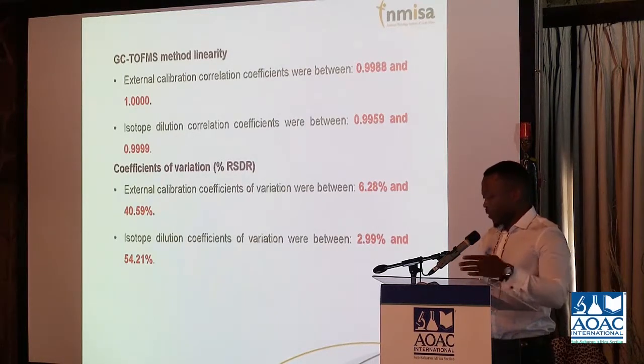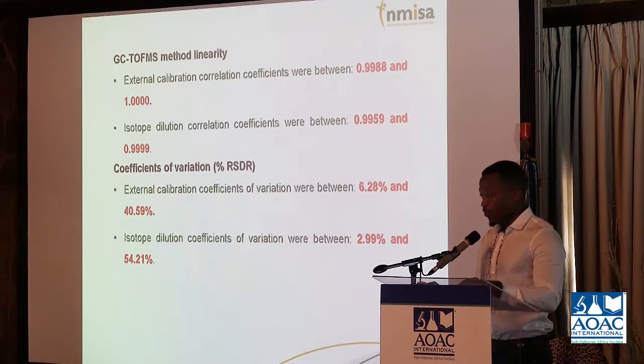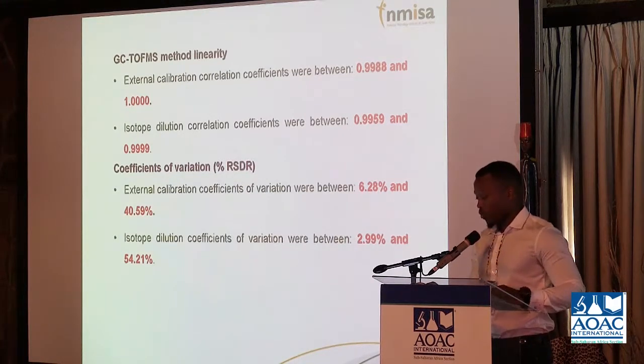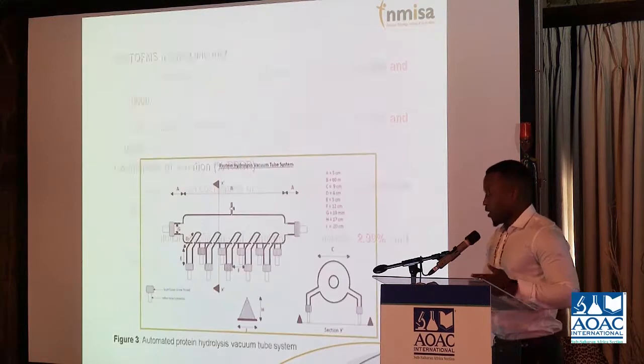Our linearity, based on the calibration range that was required, the linearity that we got for external calibration and for isotope dilution methods were closer to one, so we were happy about that. But the problem was that we were having big RSDs because of what I will try to explain now.